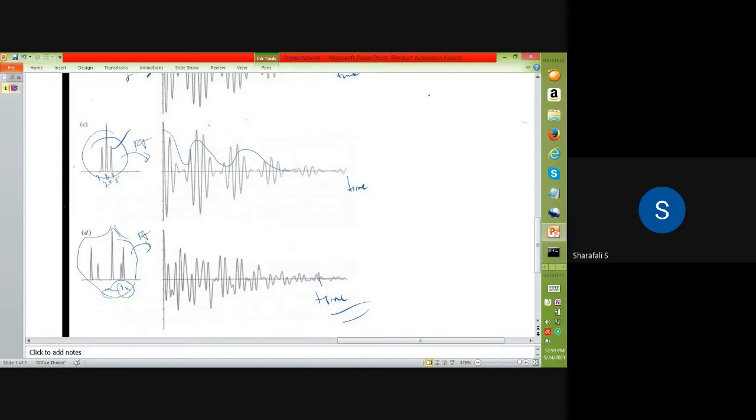So in the FTIR spectrometer, what we do is have the sample in this position, and we send all the signals at the same time. Instead, in a conventional spectrometer, we evaluate each of the frequencies separately. But in this case, we send all the spectral frequencies at the same time into a single point, and there will be interference at this point for this sample.